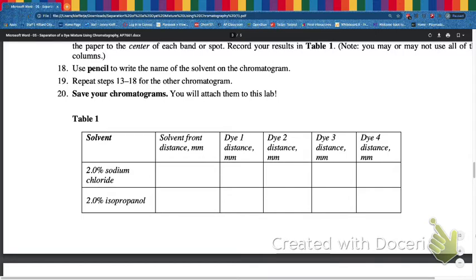So today, the first thing you're going to do is go back and find your 4 chromatography strips, and then attach them into your laboratory notebook. If you've been doing the 2-column thing with your observations and there's room on that last page where you can attach the strips, that's fine. If not, draw an X, initial it, and then go to the next page and attach your 4 strips. You may use tape, you may use staples, you may use glue sticks.